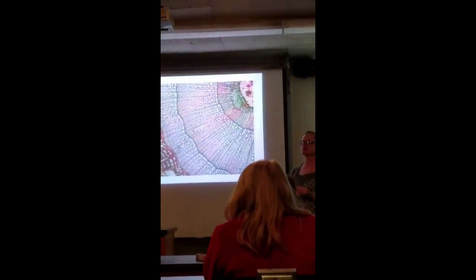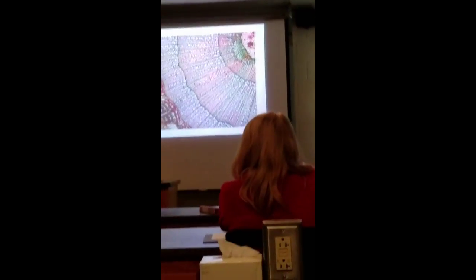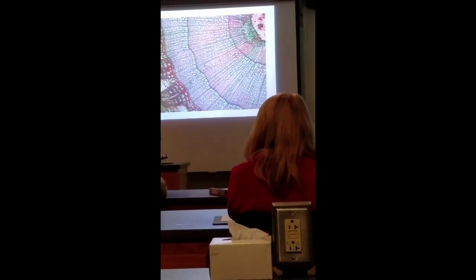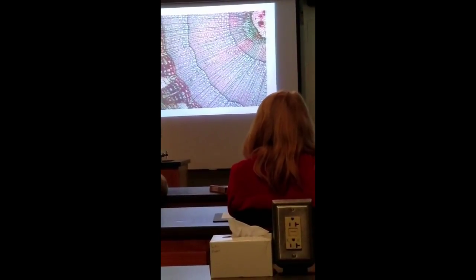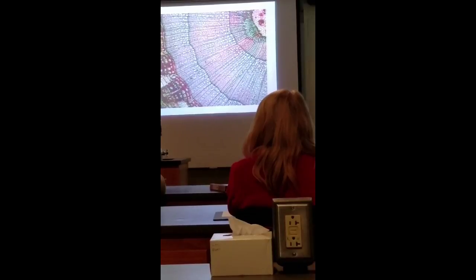Say it out loud. Okay, so I'll make sure we're all. And now is this herbaceous or woody plant? Woody. Would it be a monocot or dicot? Okay. How old is this stem? Okay. And what are we counting? What is the tissue that we're counting?